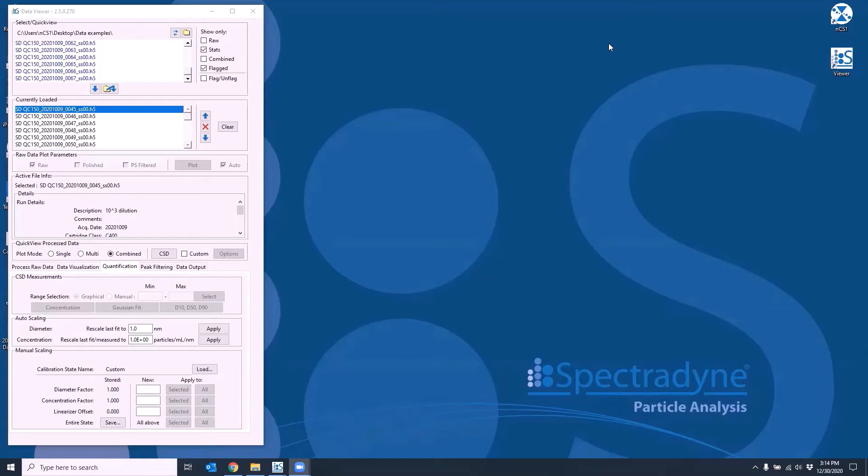I have here multiple stats files from a single particle measurement run. What we would like to do with these multiple files is to combine them into a single entity for simpler manipulation.